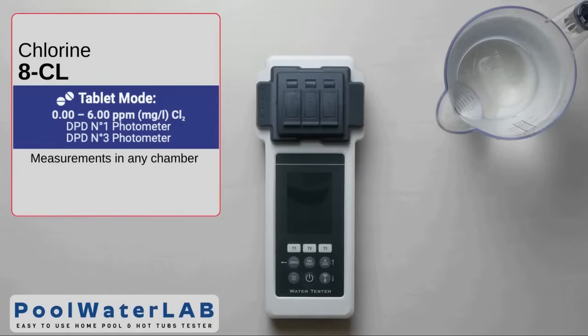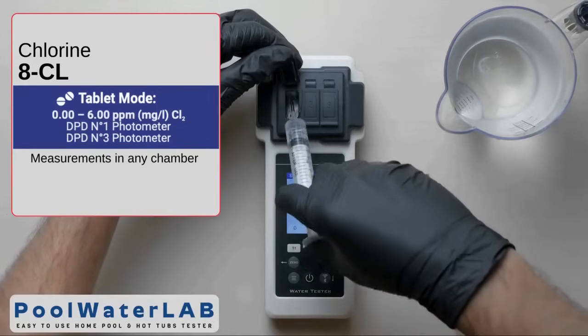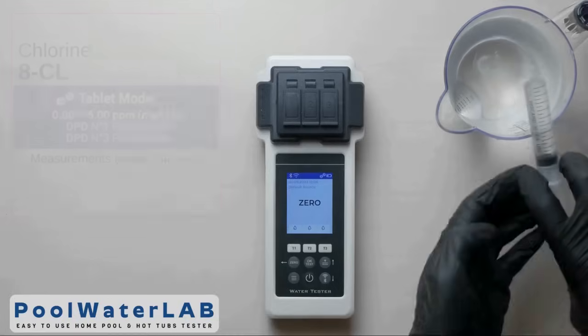Turn on the water tester using the power button. Add a water sample to all three measuring chambers with a special syringe, exactly 10 milliliters in each.